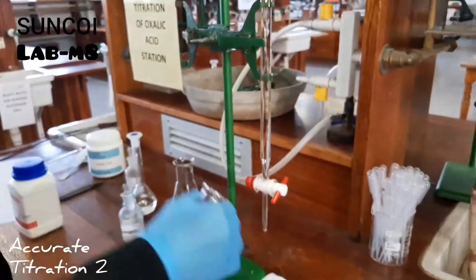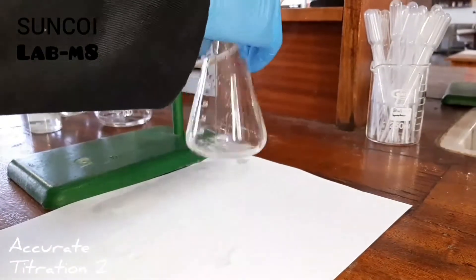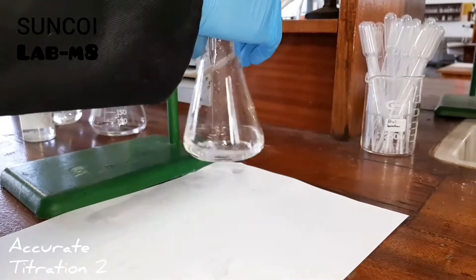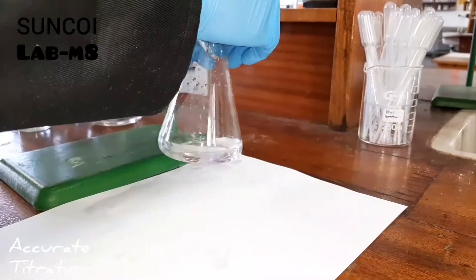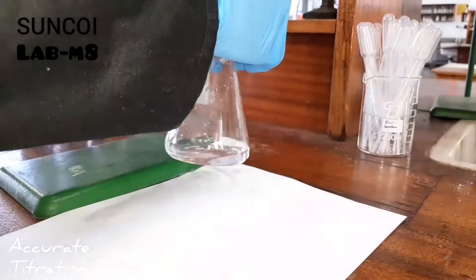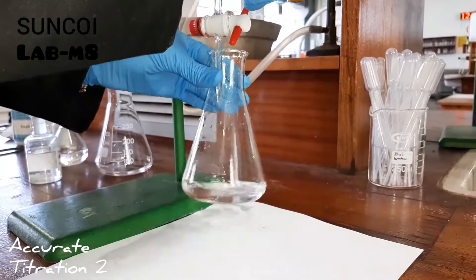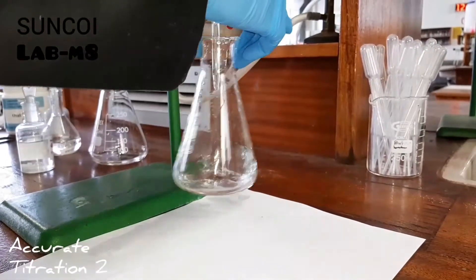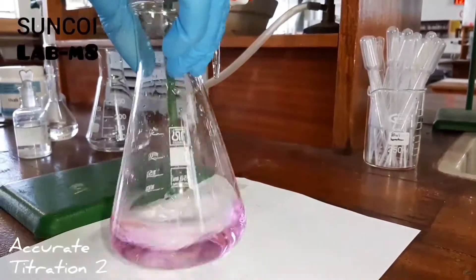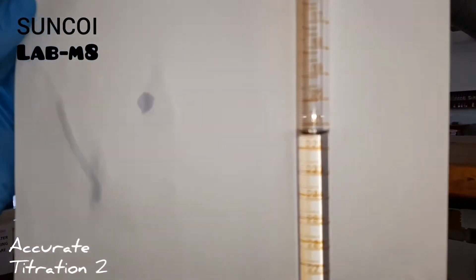Starting at zero again, we are ready for accurate titration two. The video speed is increased, but we just want to show the titration. When we reach the end point you must be very careful as you get closer, because as I said before it's a matter of one drop. There we've reached the end point — pause your video and take down the volume.